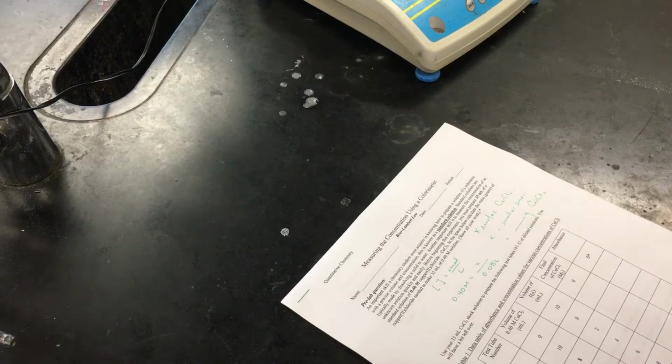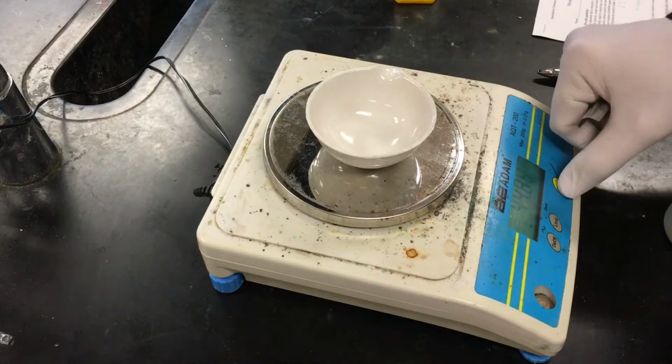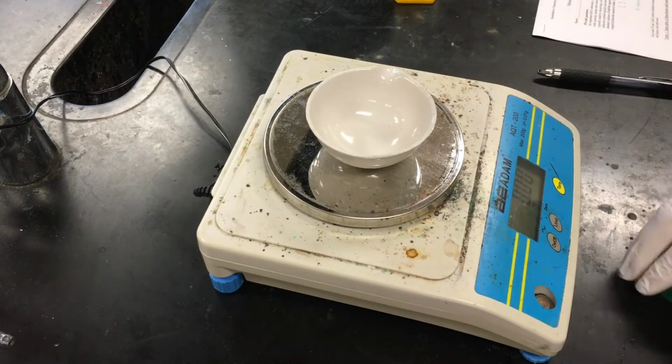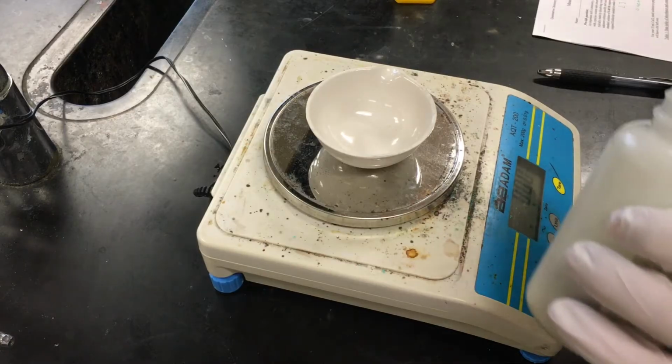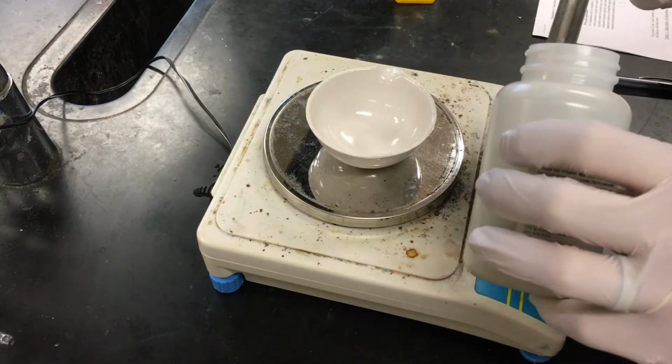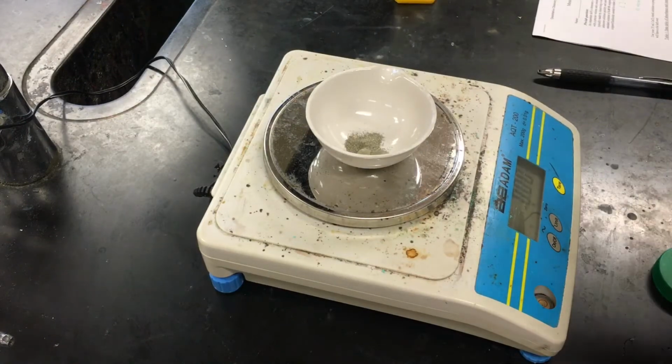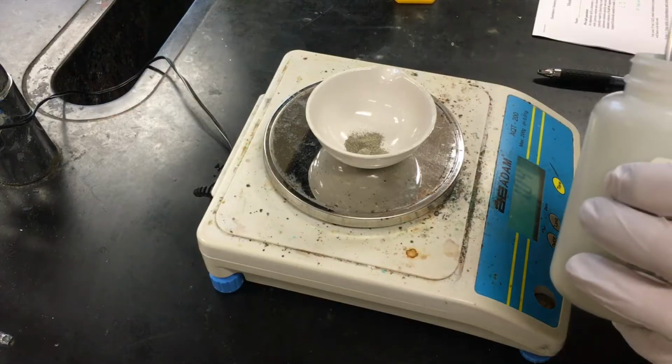Okay, so I'm going to go ahead and prepare this. I'm going to zero out a container, and then I'm going to add the copper chloride now that I've carefully calculated the amount that I need. I'm going to weigh that amount very carefully.